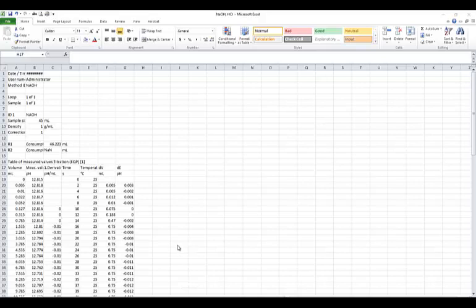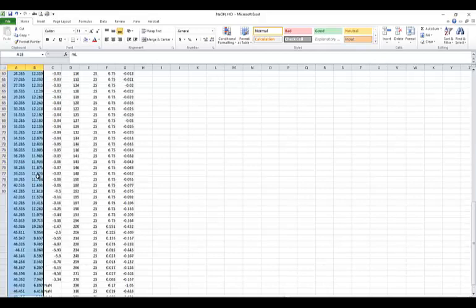So we want to do a derivative plot and a titration curve from this output, which is the sodium hydroxide hydrochloric acid titration. A titration curve has pH on the y-axis and volume on the x-axis. So that's our first two columns here in our data. We're going to highlight from there to the bottom of that column. So that's going to be shift and then end and down arrow. That gives us the entire column.